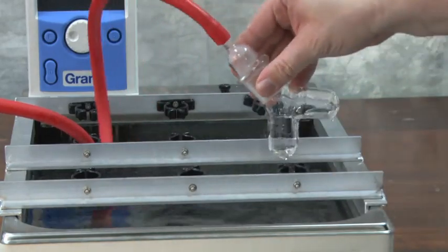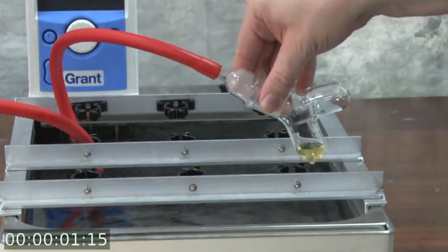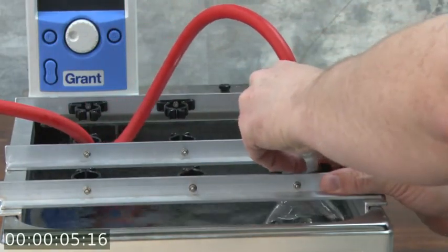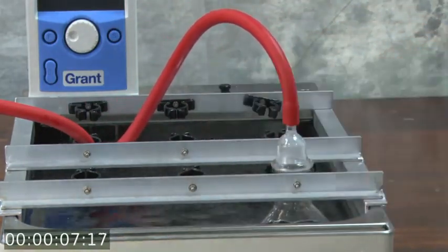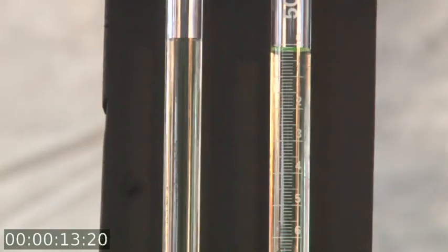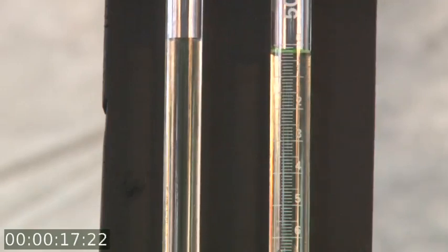Mix them together, immediately start the clock. You can see some iodine being formed as the colour changes. You get a bit of oxidation to iodine, and the reaction has started, and immediately you can see some gas being evolved. So this is going to come down. It started at zero, it's now going down.